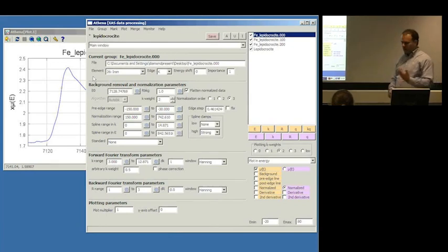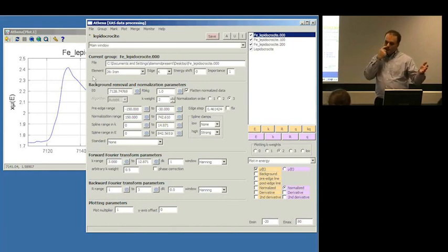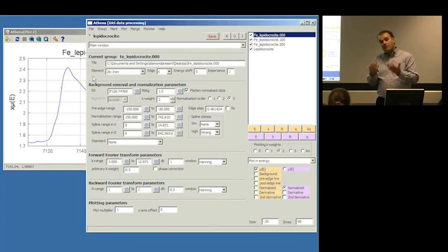It's used in normalization. So if you have an ensemble of data and you want to normalize everything so that you can do some analysis, then you need to choose E0 in a way that the ensemble is processed consistently. And depending upon data quality and how the data is measured, that could be a squishy definition. What I mean by consistently could be a little hard to put my finger on.